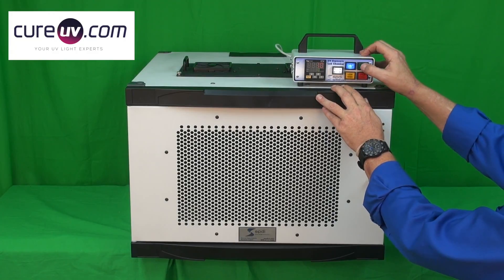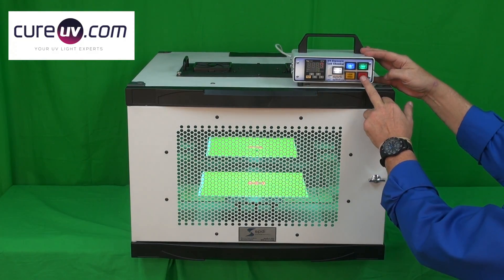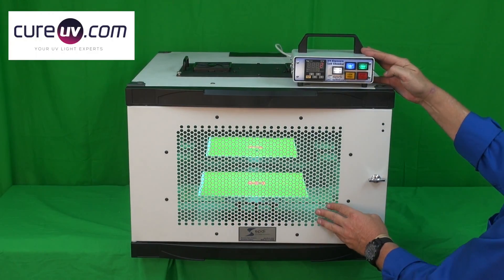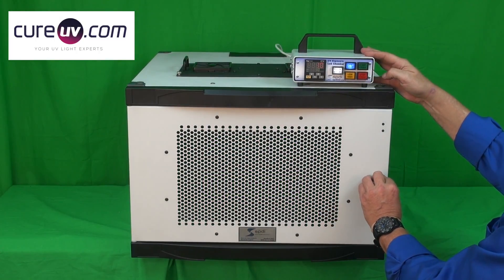With a simple start, all interruptible whether you stop the cycle or open the door, with safe viewing through the front, you can watch your specimens as they're exposed.